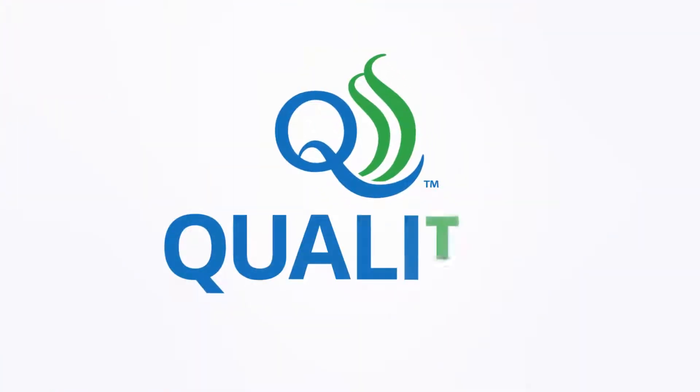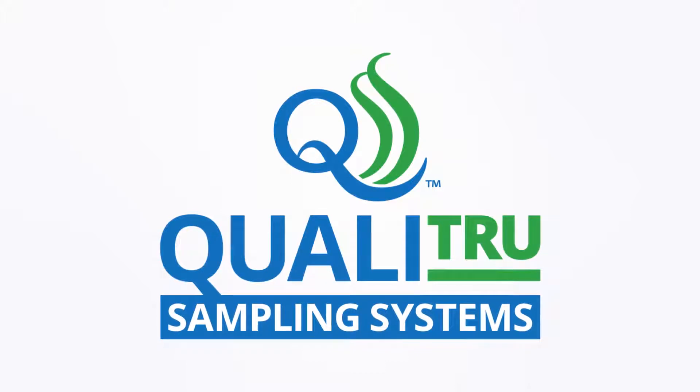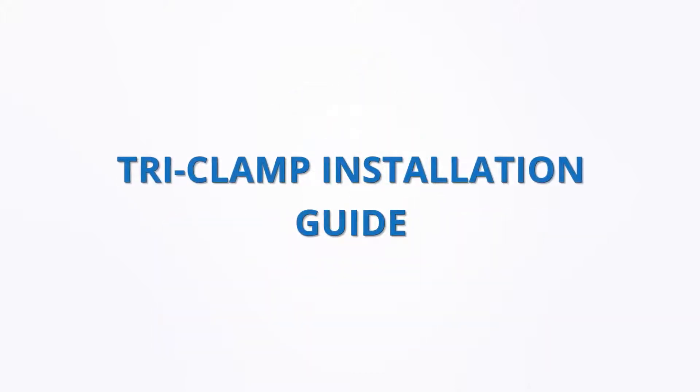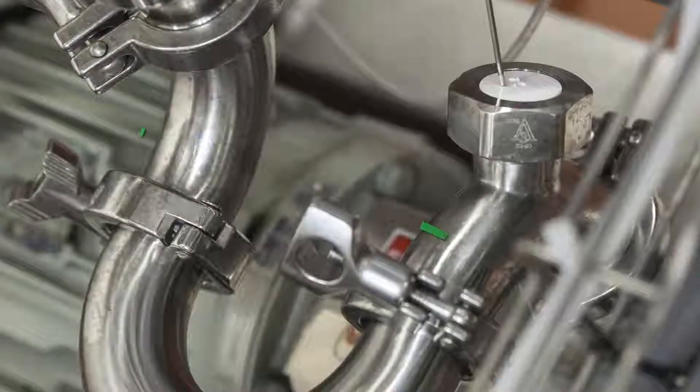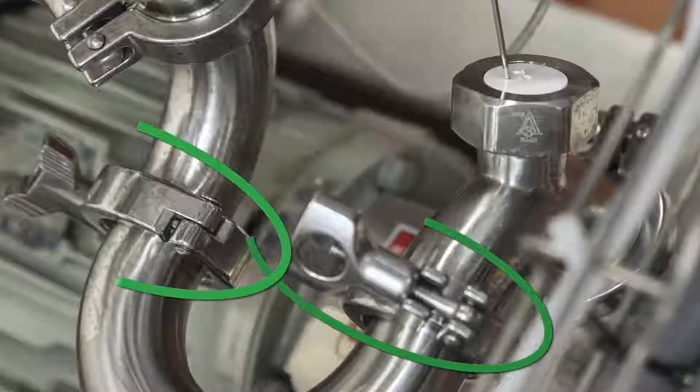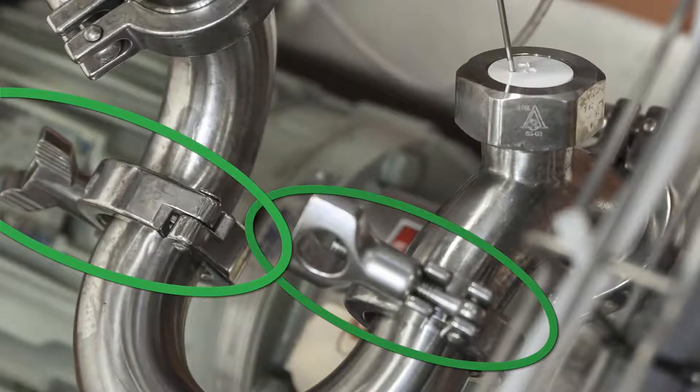Welcome to the QualaTru sampling system's installation instructions for tri-clamping QualaTru sanitary ports. QualaTru sanitary ports can be either welded or tri-clamped in place. The following tutorial demonstrates the proper tri-clamp method for installing QualaTru sanitary ports with beveled ends.